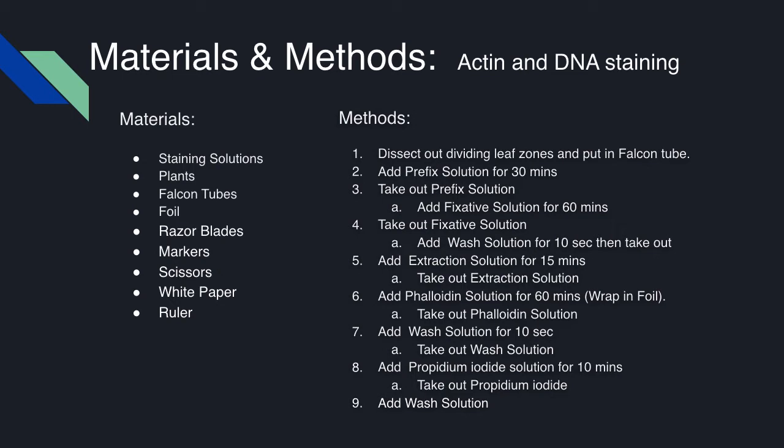After an hour, the fixative solution was taken out and 1 milliliter of wash solution was added for 10 seconds and taken out, which was followed by 1 milliliter of extraction solution for 15 minutes, which gives more holes in the membrane. After 15 minutes has passed, the extraction solution was taken out and the Falcon tube was wrapped in foil to prepare it for the next solutions, which are light sensitive. After being wrapped in foil, 1 milliliter of phalloidin solution was added for an hour.